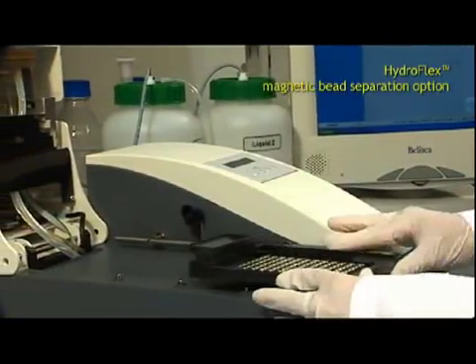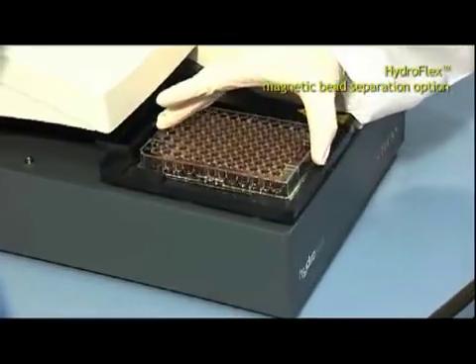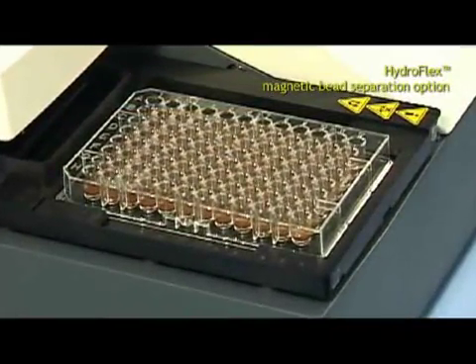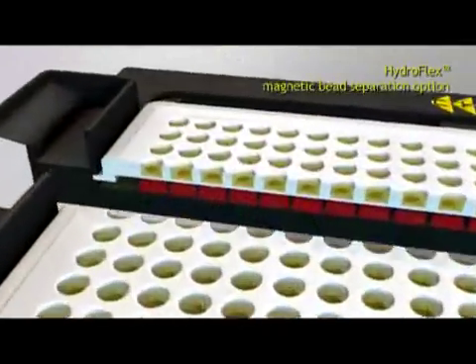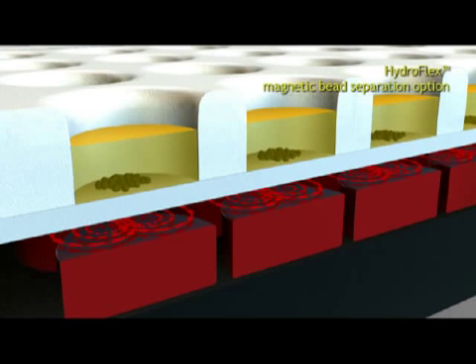Slip on the magnetic carrier and the HydroFlex can also cover the demand of magnetic bead separation as an innovative cutting-edge method. HydroFlex provides flexibility in defining wash parameters and offers the use of various magnetic particles of different ferrite concentrations and size.